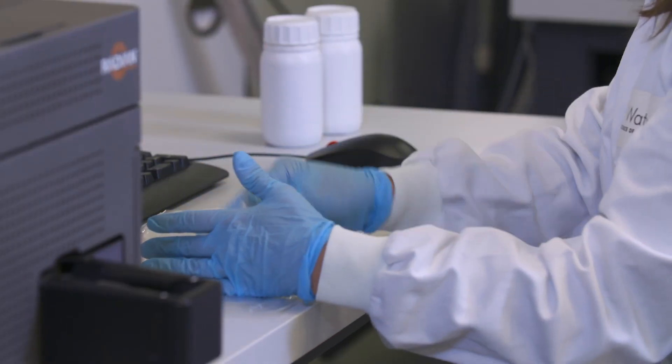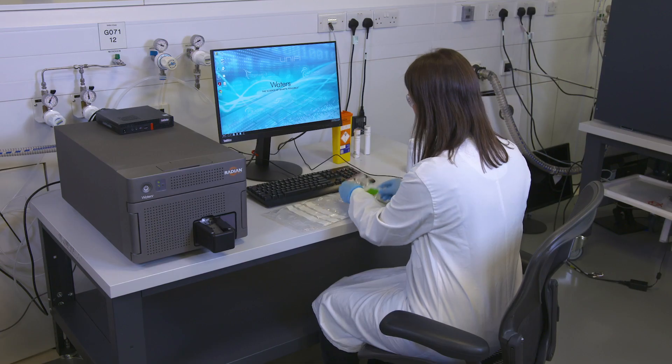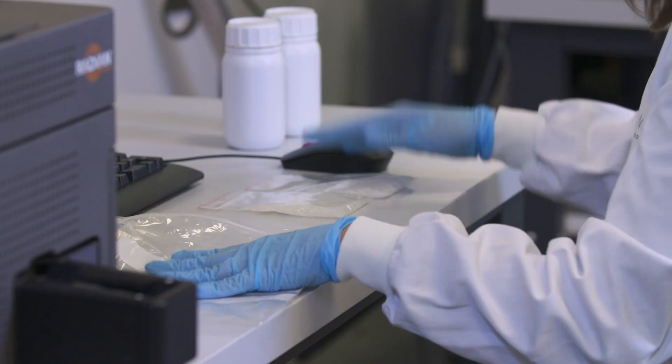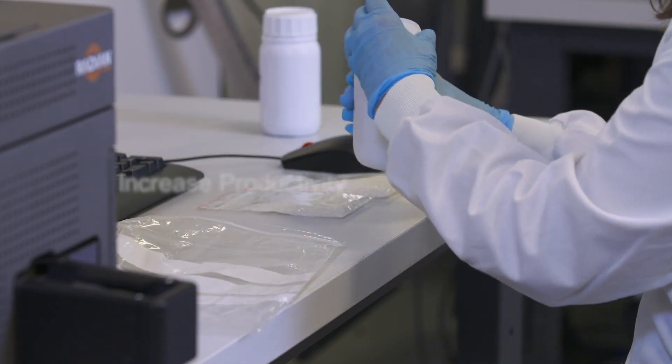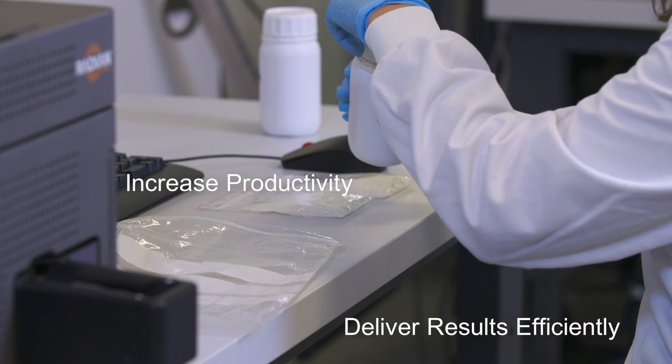Decreasing the time to generate data on which decisions are made is key, and reduction in analysis time allows laboratories to increase productivity and deliver results efficiently.